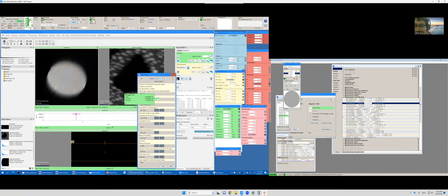Especially this MOA movement is constantly moving. Okay, so we make this stationary. And then center it using this MC11DX. Okay, and then you put the monochromator slit in by clicking here, monochromator slit in. So if you click in, you will see something is changing.